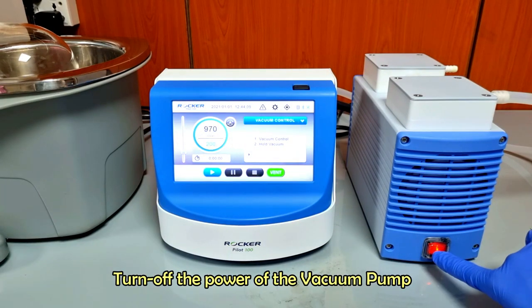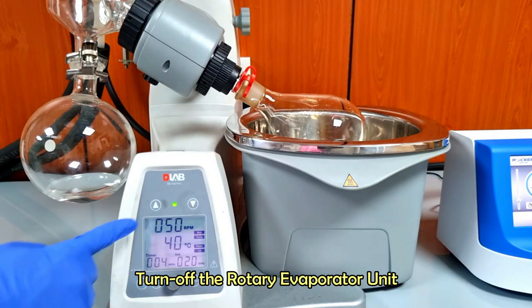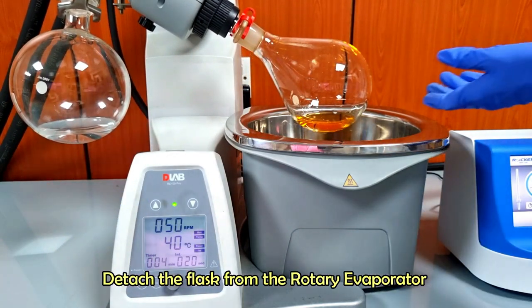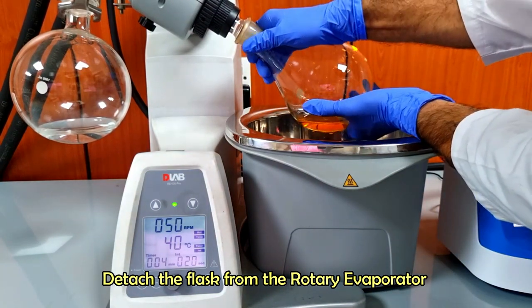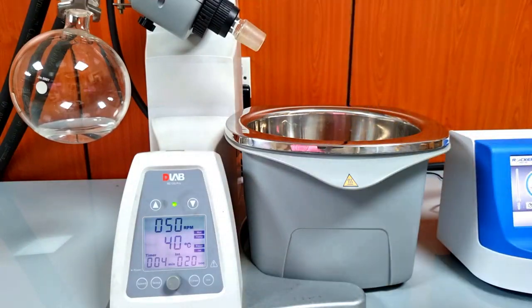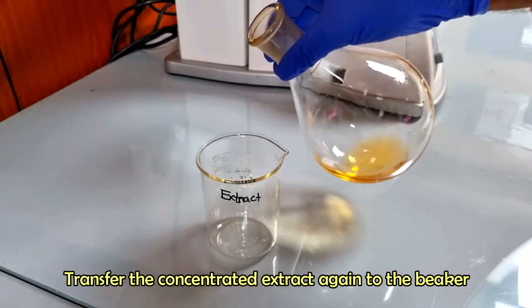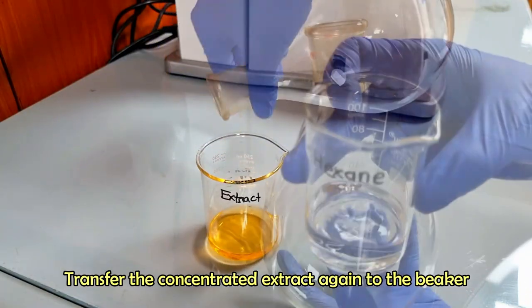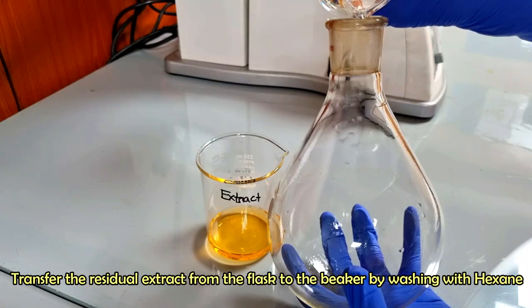Turn off the power of the vacuum pump. Turn off the rotary evaporator unit. Detach the flask from the rotary evaporator. Transfer the concentrated extract again to the beaker. Transfer quantitatively, washing with n-hexane.